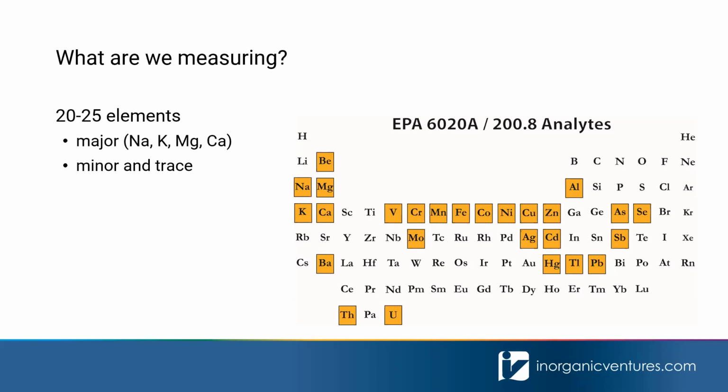So I'm a big fan of pictures, and the periodic table that you see on the right is a preferred approach of mine. And when I'm thinking about ICP-MS analyses, I tend to draw a line horizontally through the periodic table between the first and second row transition metals. And the reason I do that is because I've noticed through my experience that once you get above about mass 80, then things get really easy in the ICP-MS world.